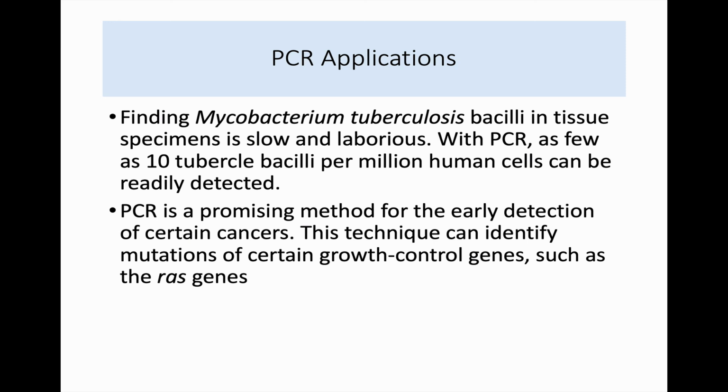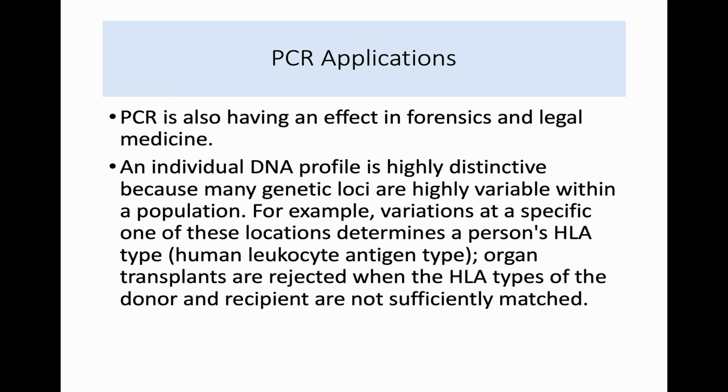Think about virus detection. If we want to find out if someone is at an early phase where the titer, or the amount of virus present, is low or high, we only need tiny amounts to be able to detect this. We don't have to wait until day 40 before we can detect things. We can detect them really early. So PCR is something that has so many applications. It really is endless. It's used a lot in different cases.